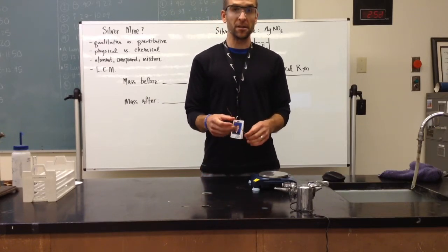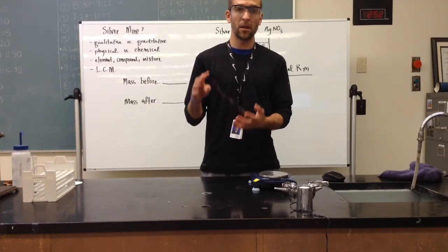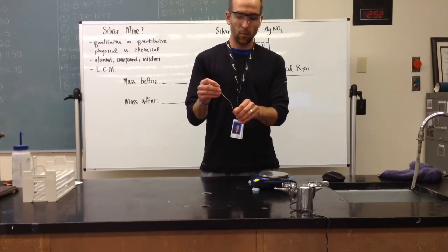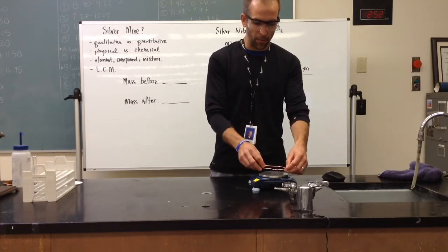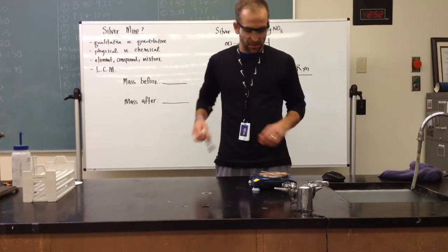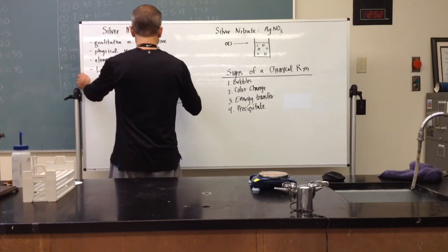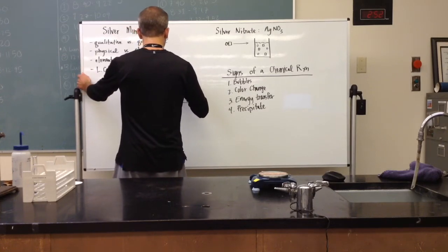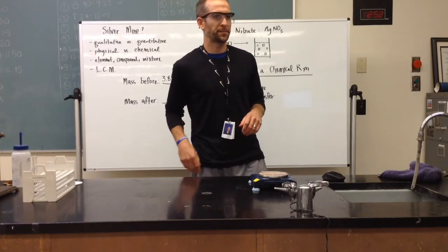So, for instance, one qualitative property that I could list, and you're going to need to list some others, would be luster. It's a qualitative property of metals. In terms of quantitative properties, the mass of our wire, so I'm going to record using a balance, is 3.82 grams. That's a quantitative property.